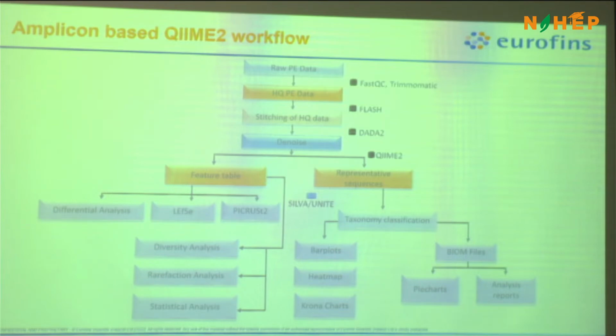Anywhere we know a target gene, we can apply this amplicon-based approach. In those cases, we use a custom database instead of Greengenes or SILVA. The custom database we make through NCBI, and then we use that custom database, where we introduce the taxonomy as well as the sequences, and then go ahead with the identification. So how does the pipeline work?